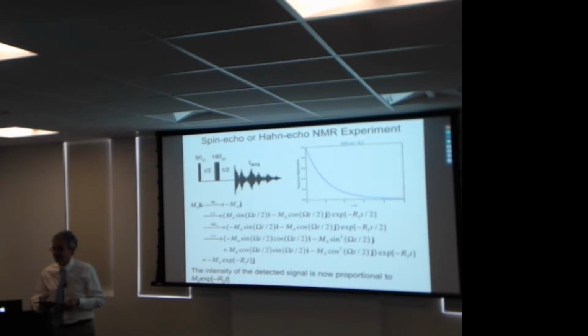We want to try to manipulate what the magnetization is doing by pulses and delays in such a way that, in our language, we'll say we can refocus certain interactions, or sometimes recouple certain interactions, make them come back when they might otherwise have gone away, make them go away if they're normally there. So this is the first example.